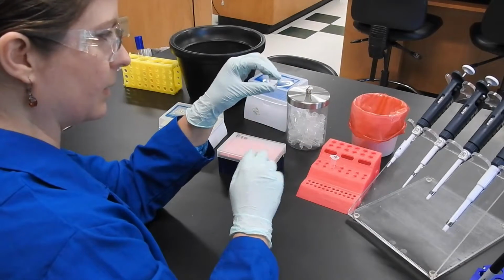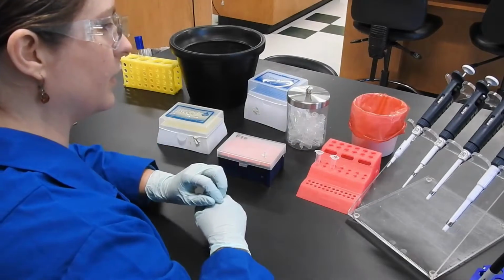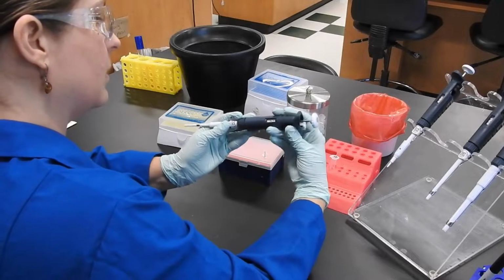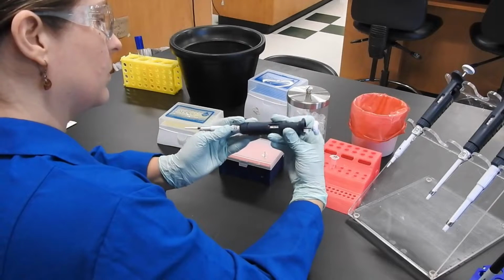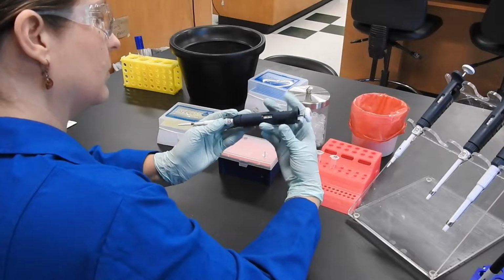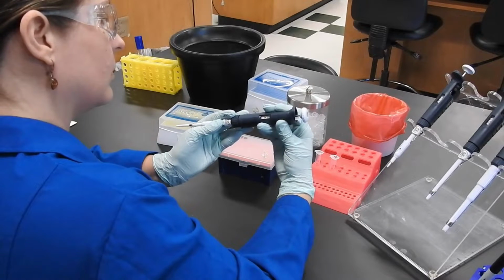This tube contains the P-Glow plasmid DNA that we transformed into the bacteria. I'm going to adjust my P20 to 5 microliters. Your experiment may contain a different amount of P-Glow. Check your protocol to determine how much plasmid you need to use.